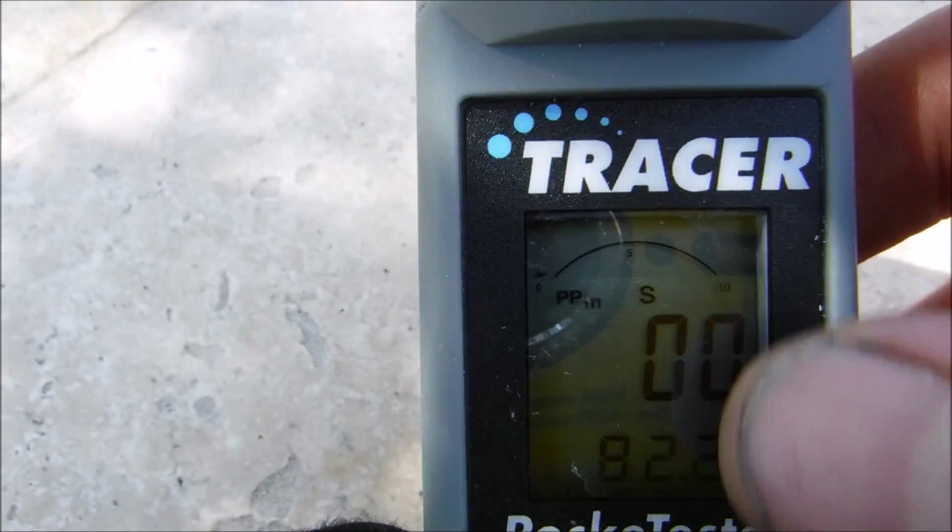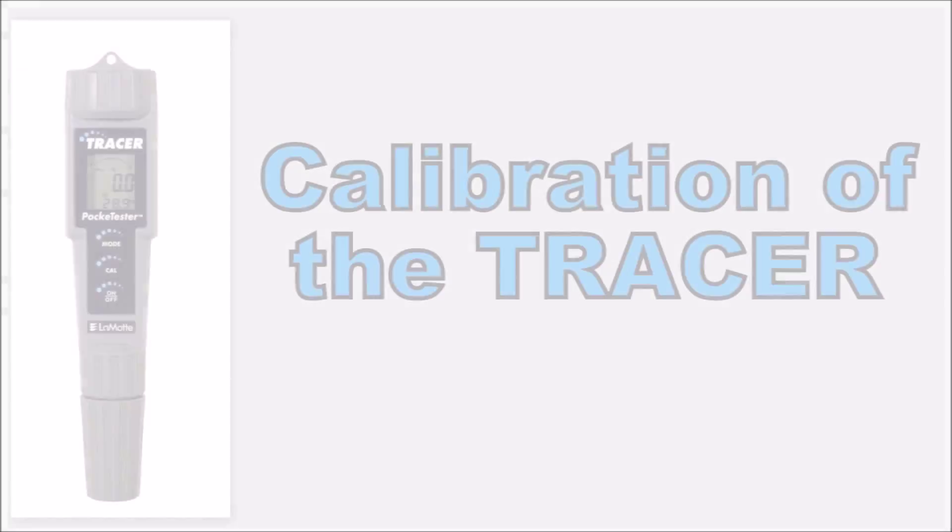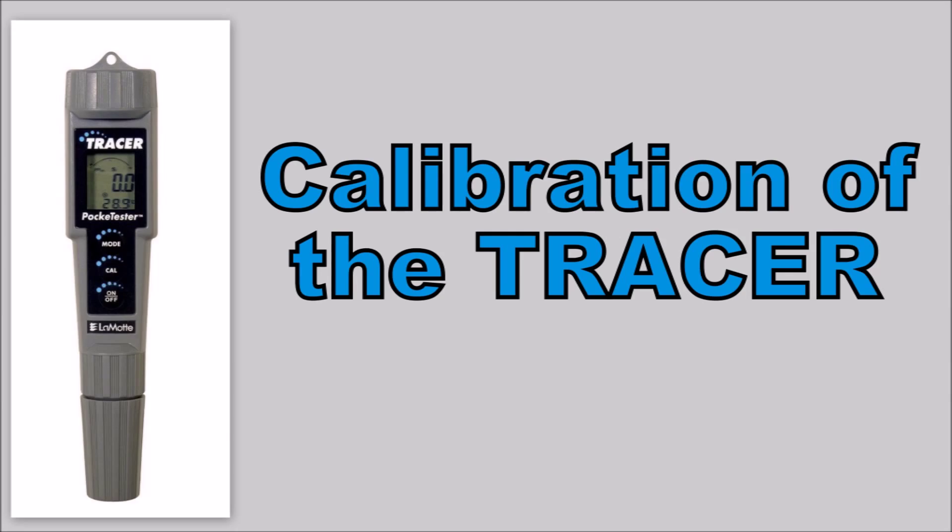When you first turn on the Tracer it's going to be in salinity mode — you'll see the S right there on the screen. When you go to calibrate the Tracer, make sure that it's in salinity mode.